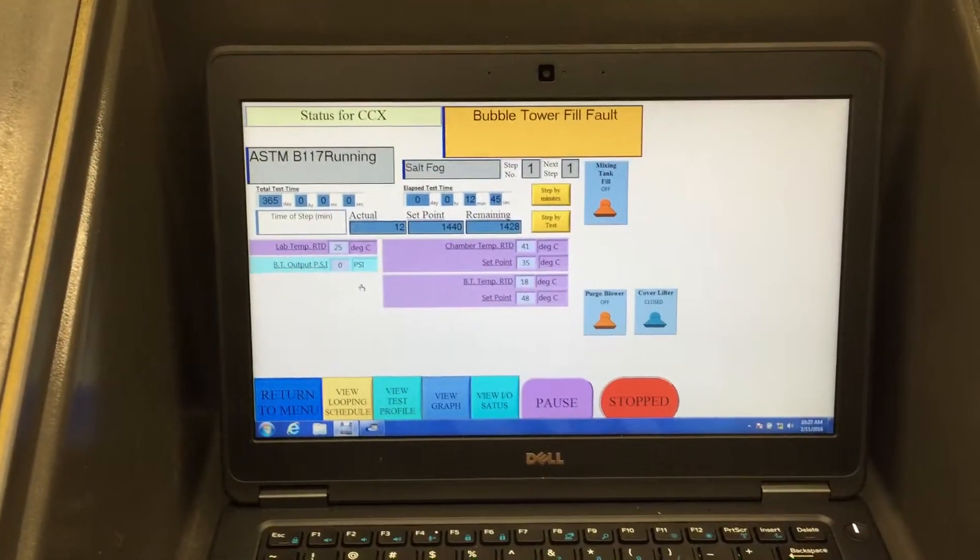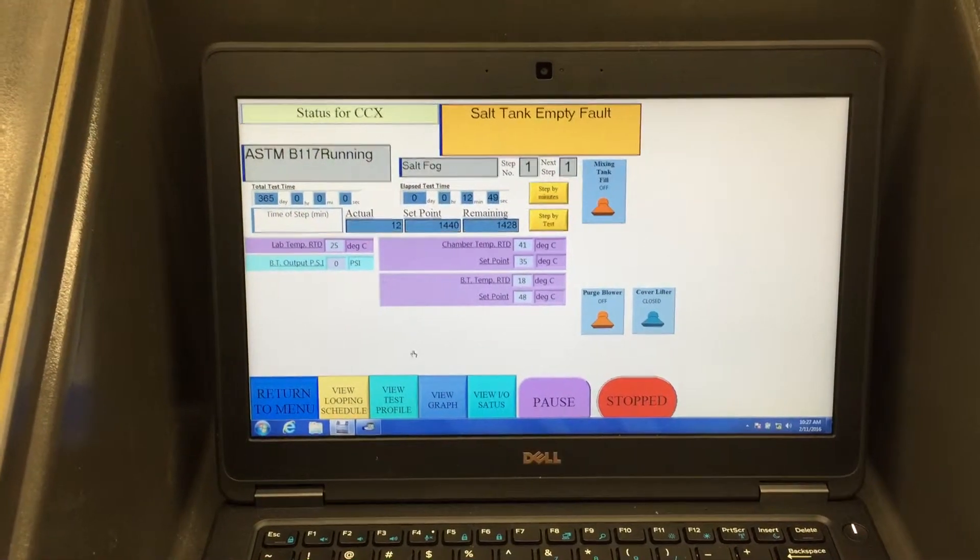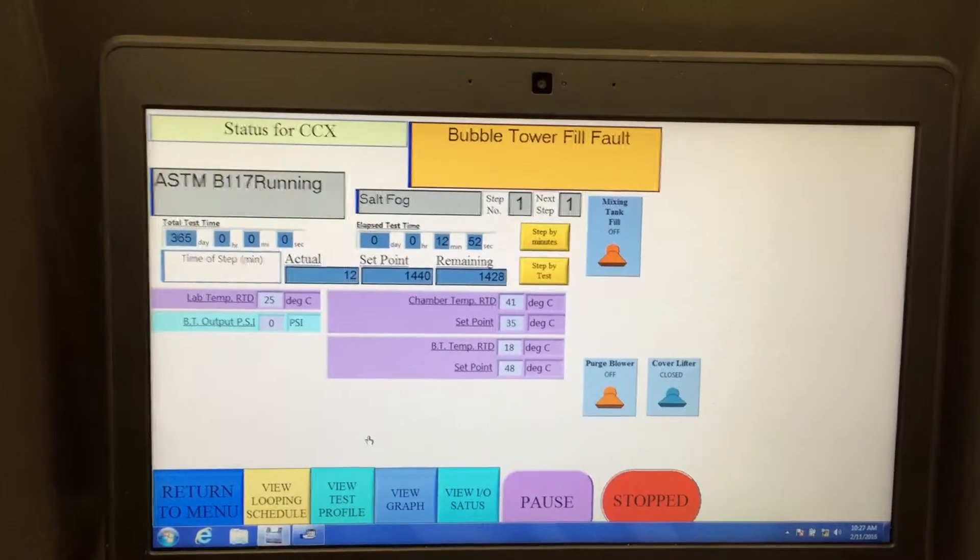This laptop controller is brand new, purchased from Auto Technology, loaded with all the software to run the tests.